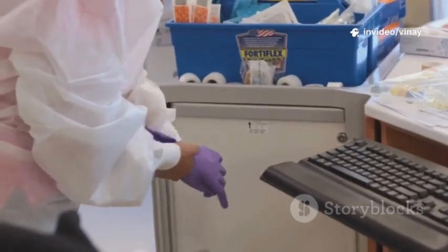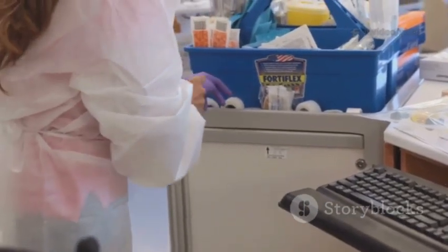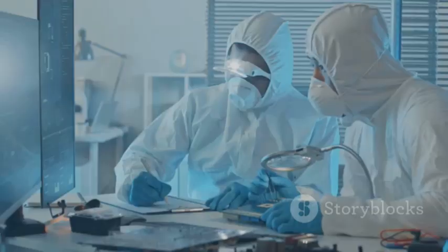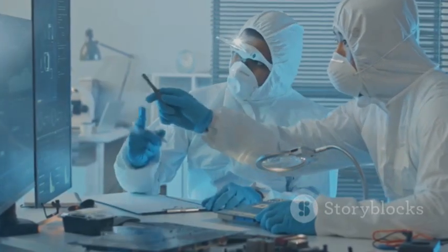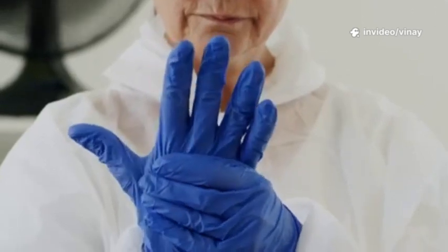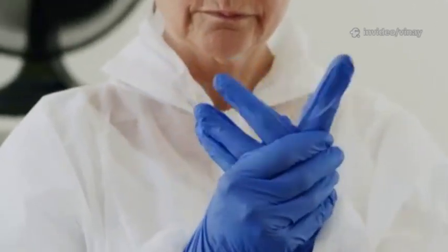Every item of this outer garment is sterile and must be handled using an aseptic technique to avoid contaminating its outer surface. The process is so critical that operators must be formally qualified, demonstrating they can gown without contaminating their gloves or the exterior of the suit.